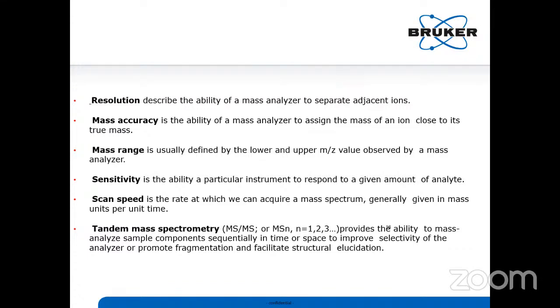Yeah. For example, if you are analyzing peptide masses in proteomic samples, within 0.1 RT time, it may release 2-3 peptides at a time. Those 2-3 peptides will go for fragmentation at a time. Your instrument should be able to identify all peaks. Okay, that is scan speed.